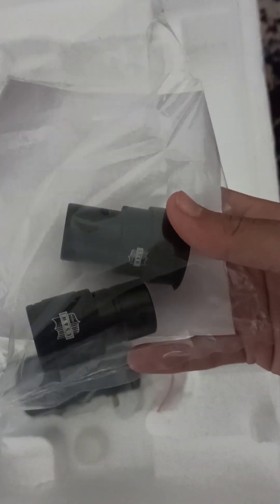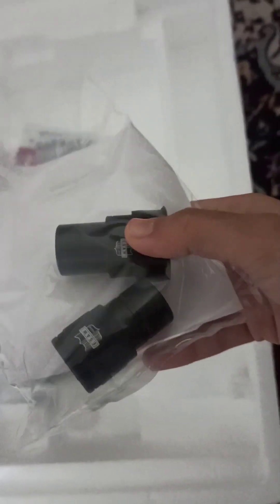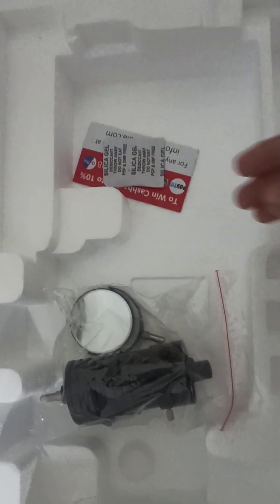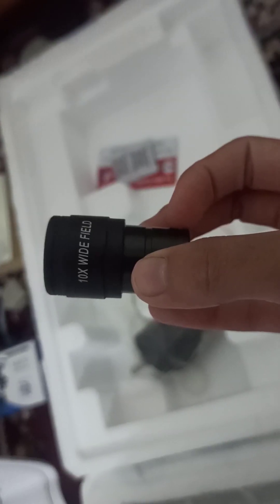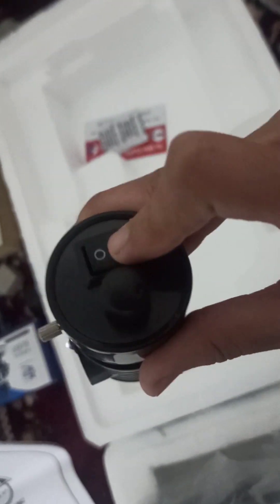Here are two types of lenses — one is 10x and the other is 25x wide field. Here we also have some cards. In total, we have 50 pieces of slides and a 25x wide field lens, and another one is a 10x wide field lens.